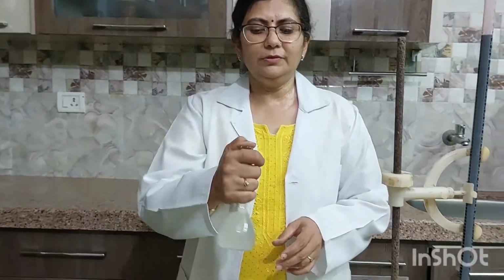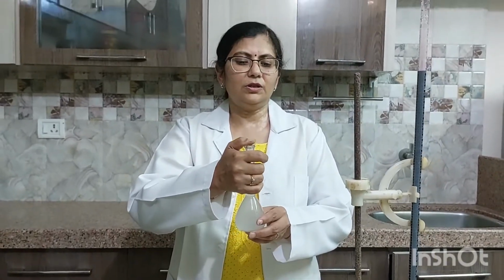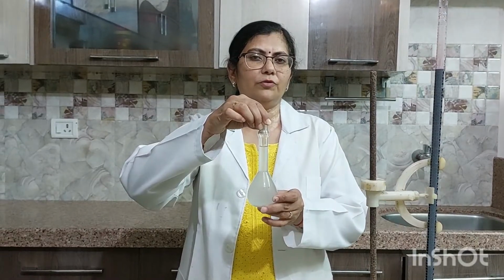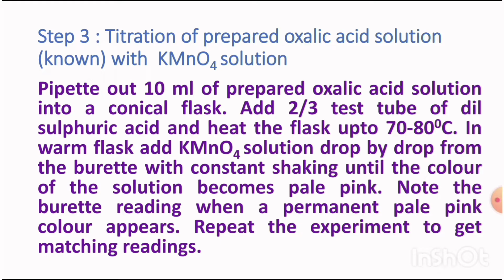Shake the solution. Now this is a standard oxalic acid solution of N by 30 strength. Titration of the prepared oxalic acid solution, that is the known solution, with KMnO4 solution.